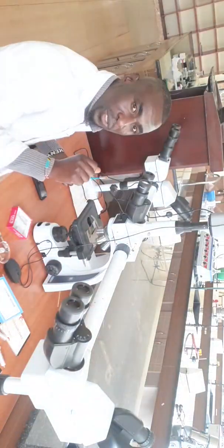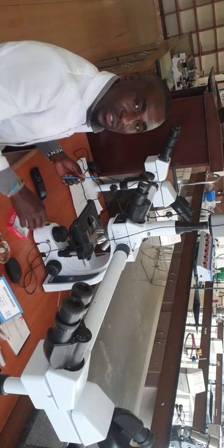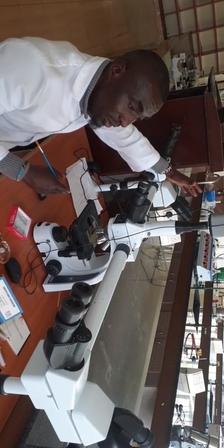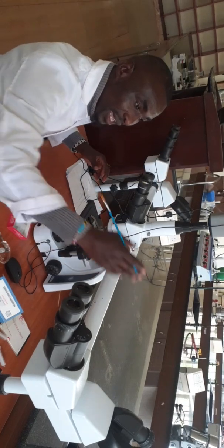You can take a photo using the mouse. This specimen on the stage will be observed by other people using these ocular lenses. And that is the technique.